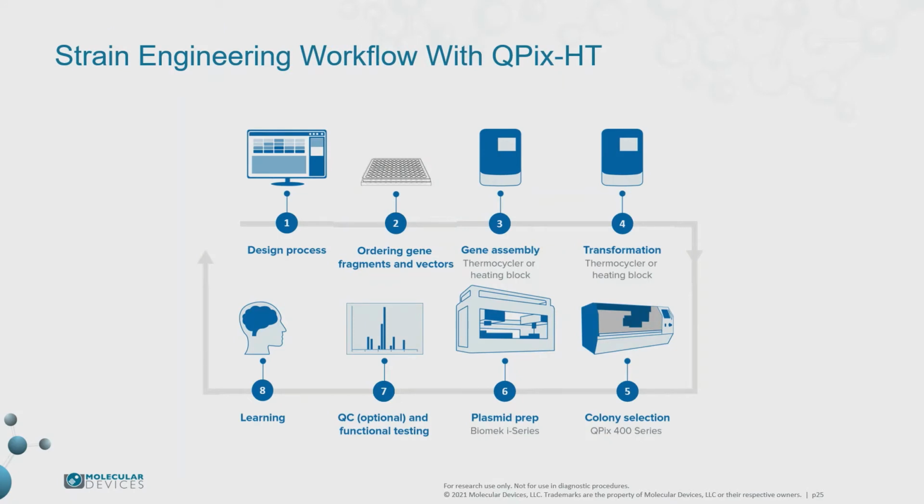This is a simplified workflow that was created for a customer who is interested in metabolically engineering the overproduction of fatty acids from E. coli to conduct catalytic conversion to alkanes as a biofuel. As previously shown, the design process defines the problem and identifies the pathway within the E. coli that produces fatty acids and which genes within that pathway would be targeted to engineer the desired effect.